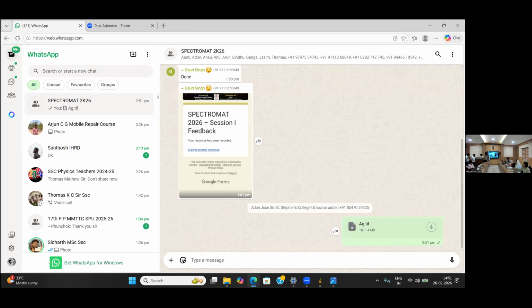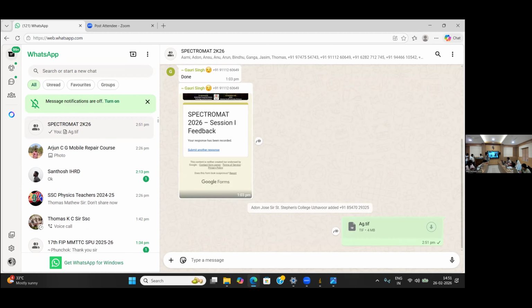Hello. So, shall we start the image analysis for silver nanoparticle in image A? So, open ImageJ software in your laptop and then load this AgTIF file using this file button.